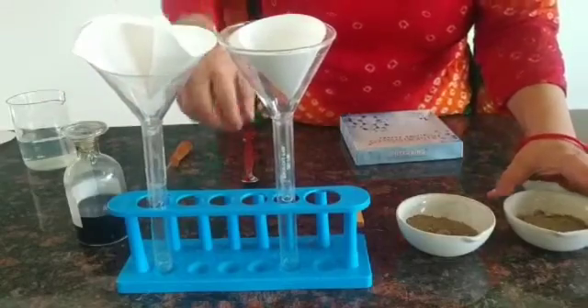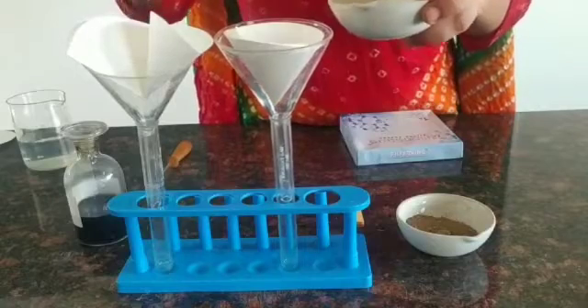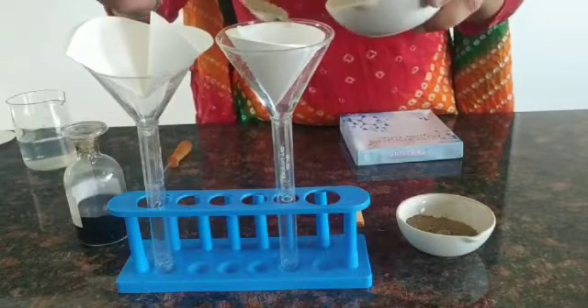This is the garden soil. We'll place the garden soil in the first funnel and then the roadside soil in the second funnel.